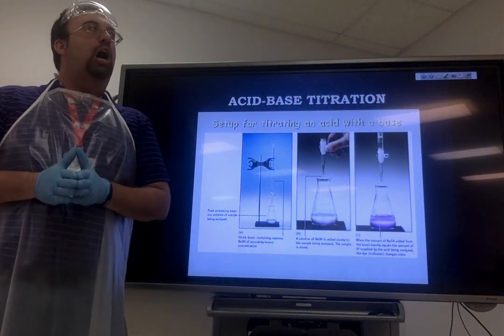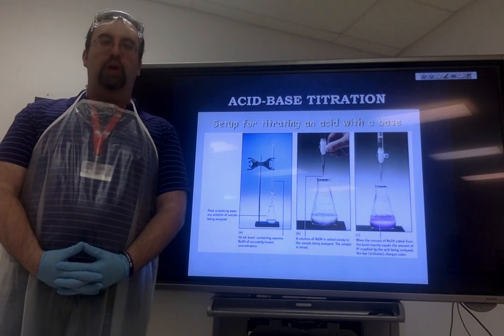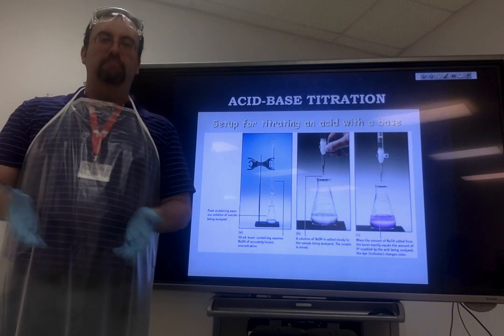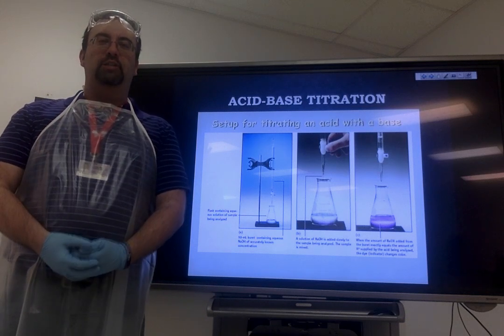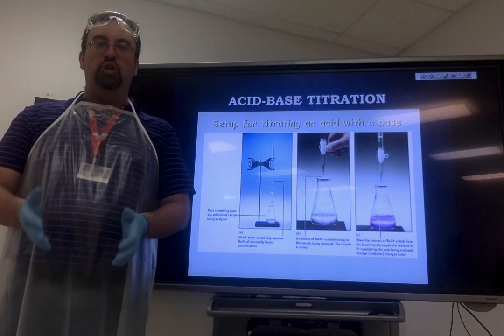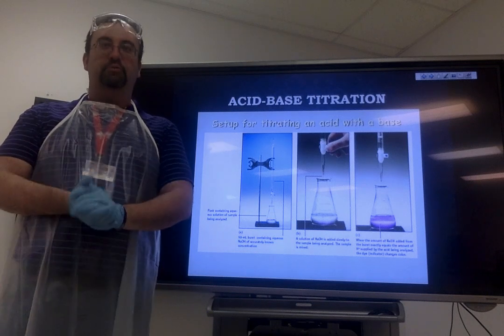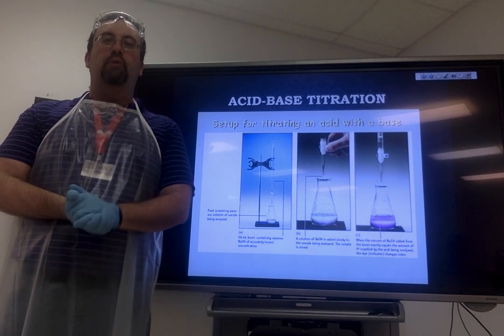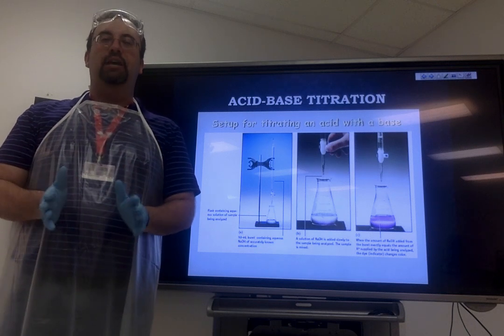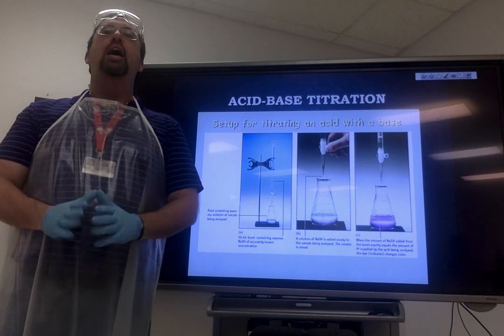We're going to go ahead and talk about titrations, and I will demonstrate it to you today as well. You would have had this as a lab experiment, and because of the circumstances, we were not able to have you guys do it. But I will go ahead and do what you guys would have done in the lab, and this would have been the final lab for you for the year. It's also sort of a rite of passage, as it were, so every chemistry student typically does at least one titration lab before they are done with the class.